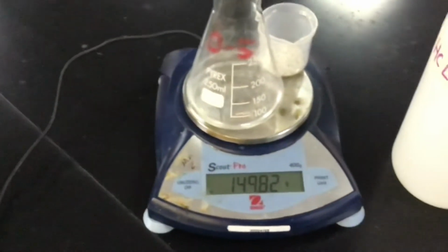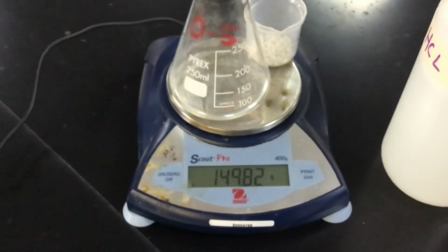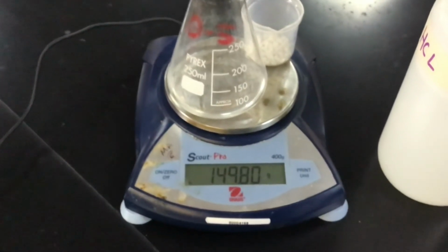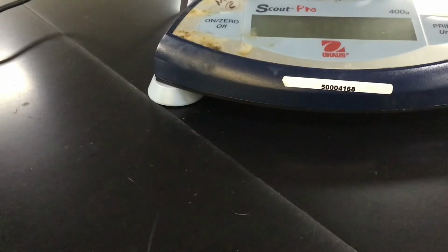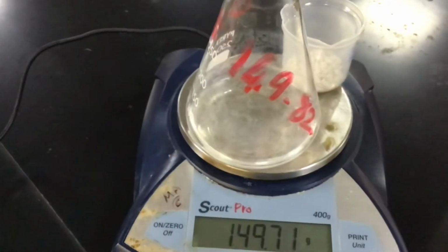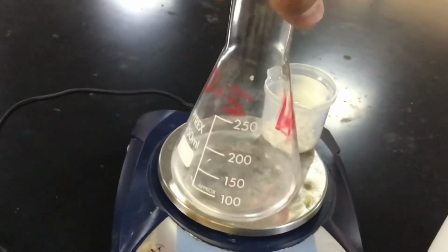So 30 millilitres, and it's 149.82. So I'll just write that on. On the side of the beaker it says 149.82 with 0.5 molar.